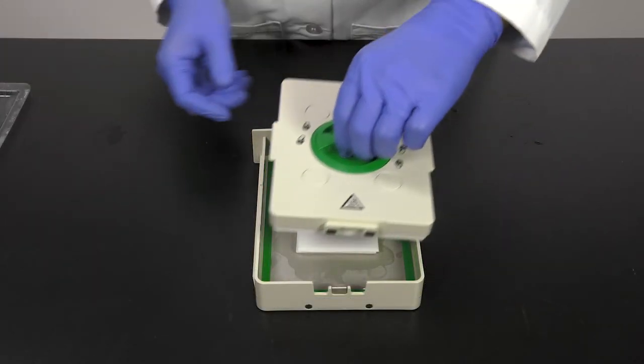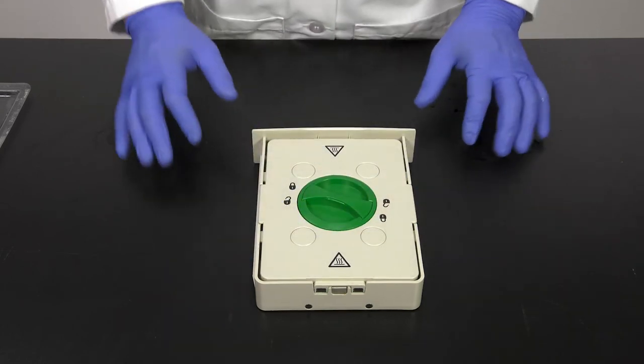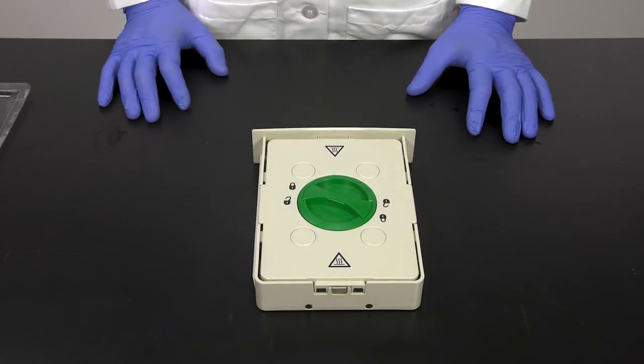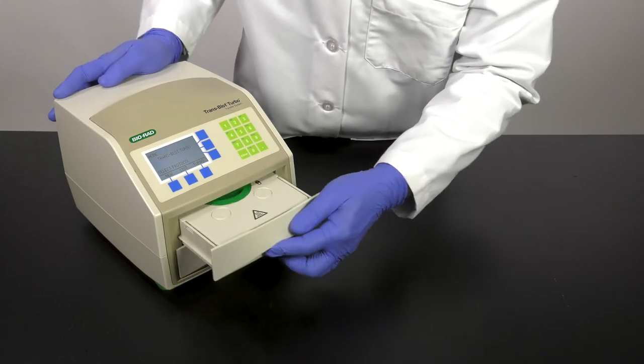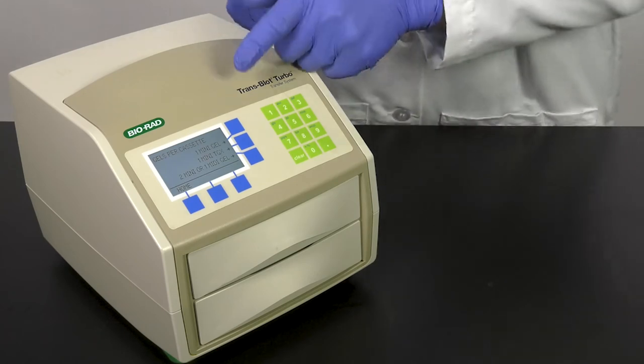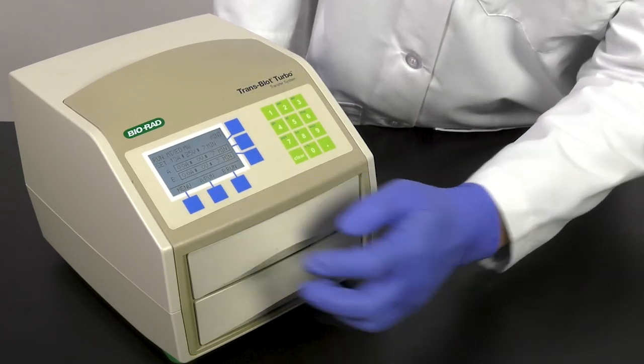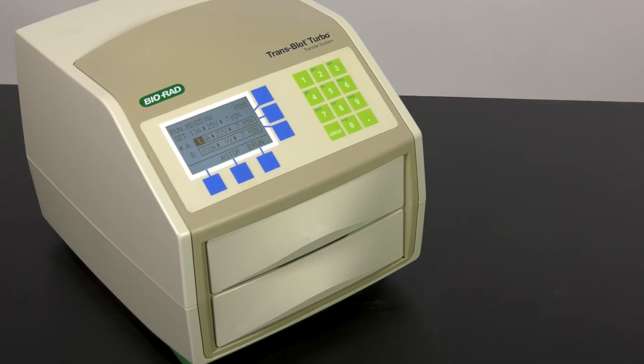Place the cassette cover over the top of the stack, press firmly and turn the green knob to lock the cover in place. Insert the cassette into the instrument, then access the turbo protocol for a 7-minute rapid transfer. If you are using a mini protein TGX precast gel, you can use the Turbo TGX protocol and complete a transfer in 3 minutes.